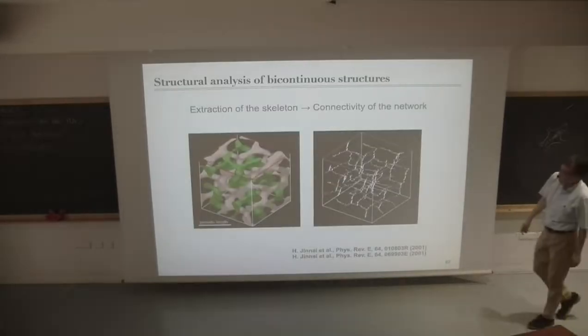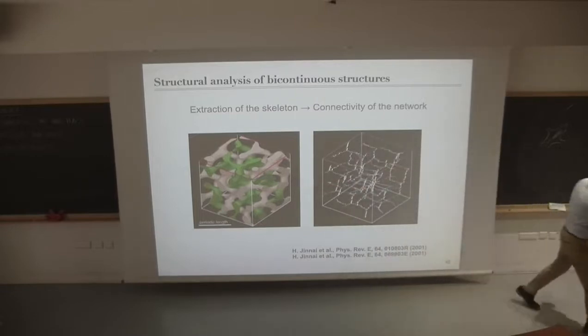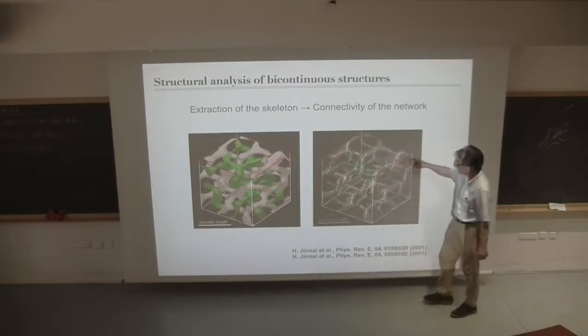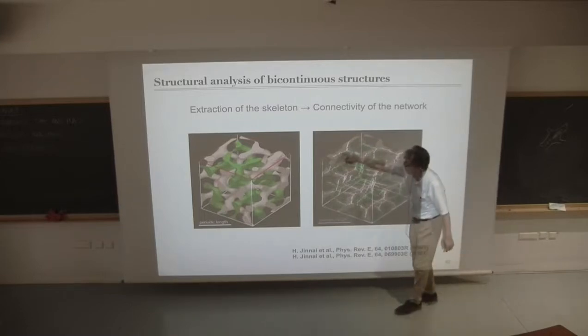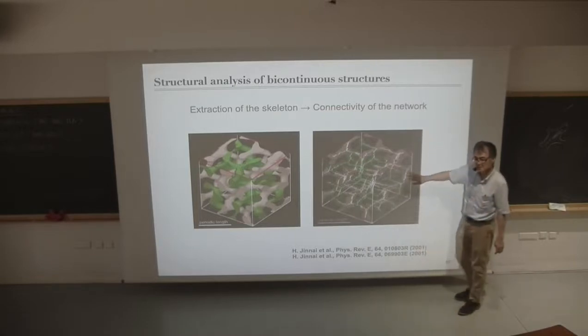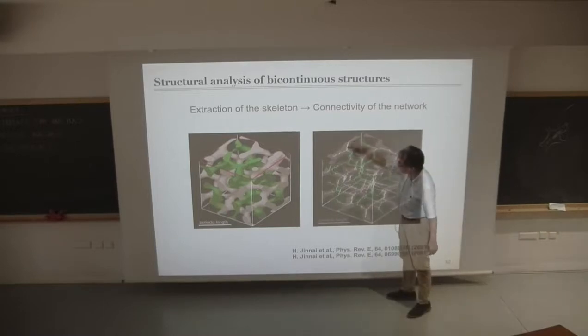That's real experimental data. This is the input, and this is the output. And then if we overlay the domain on this, I hope that I can persuade you that the resulting thread is right in the middle of this domain. I hope I can persuade you, right? Then I just follow from here, and then I find a junction here, and then I can find this is a 3 connector, and then we can do that and find another one, and we can keep on going.